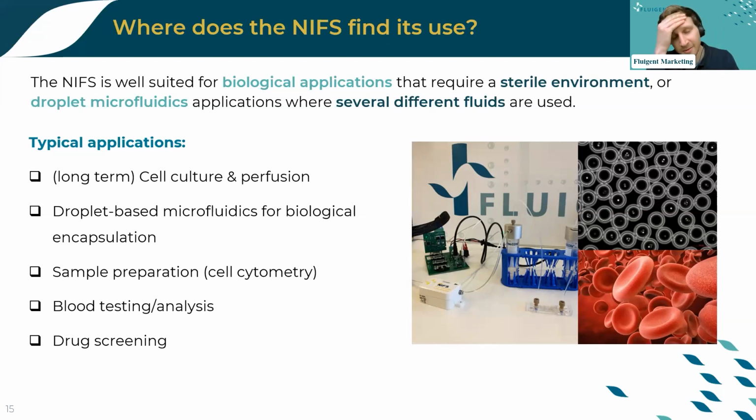So they are really willing to use this kind of sensor. And then, of course, sample preparation for cell cytometry, blood testing. Of course, you don't want to use blood in your flow sensor, otherwise you need to clean it. It's very dirty and complicated to clean. And drug screening applications also.